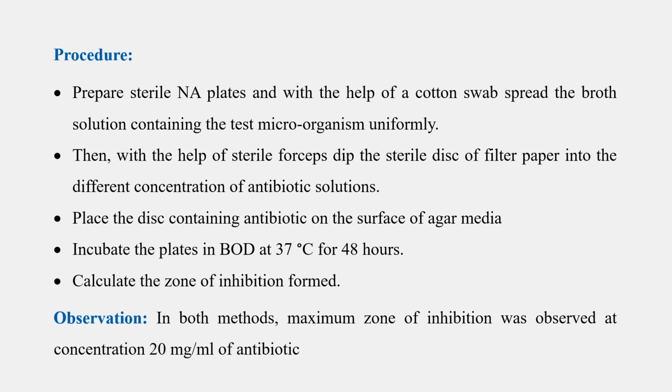Observation. In both methods, the maximum zone of inhibition was observed at a concentration of 20 mg per milliliter of antibiotic.